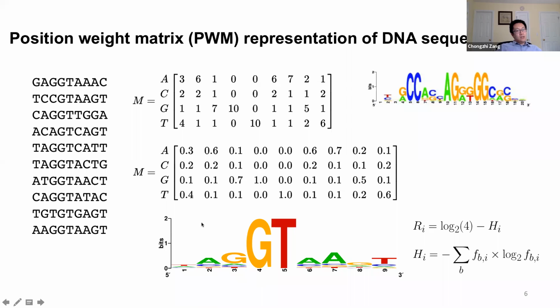Not every motif discovery tool uses the same definition of sequence logo. Many of them do not include this information content, but simply represent everything using the relative fraction of the 4 nucleotides and represent them as relative heights. In that case, the sequence logos will all have the same height.